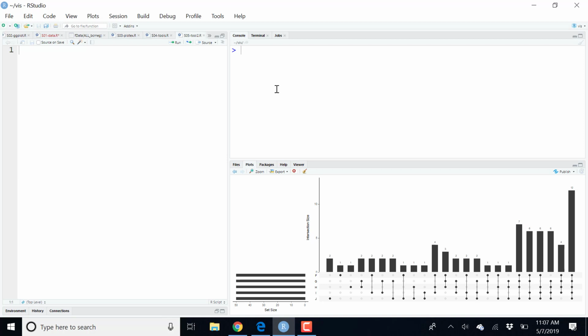And typically the way this is visualized is using a tree-like structure, a dendrogram, where the leaves are all individual samples, and then we start to combine them based on this clustering result.